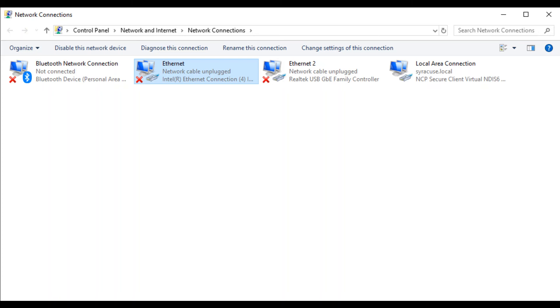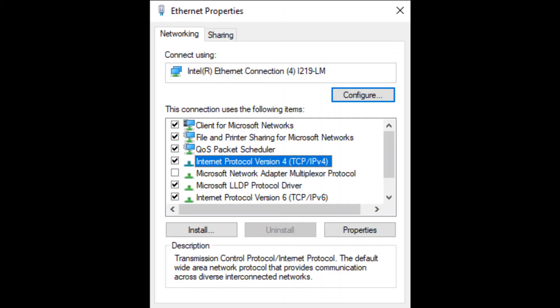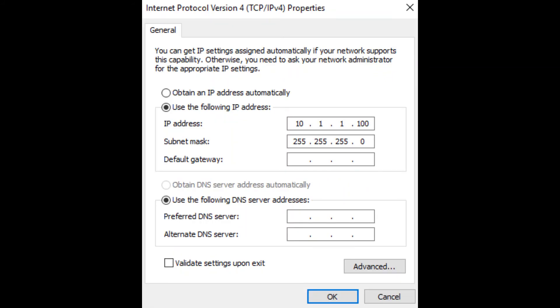In your computer's network settings, find the Ethernet adapter connected to MicroGC Fusion. Double-click to enter the Properties window. Locate Internet Protocol Version 4 and double-click. From this window, click Use the following IP address and enter the IP address and subnet mask.